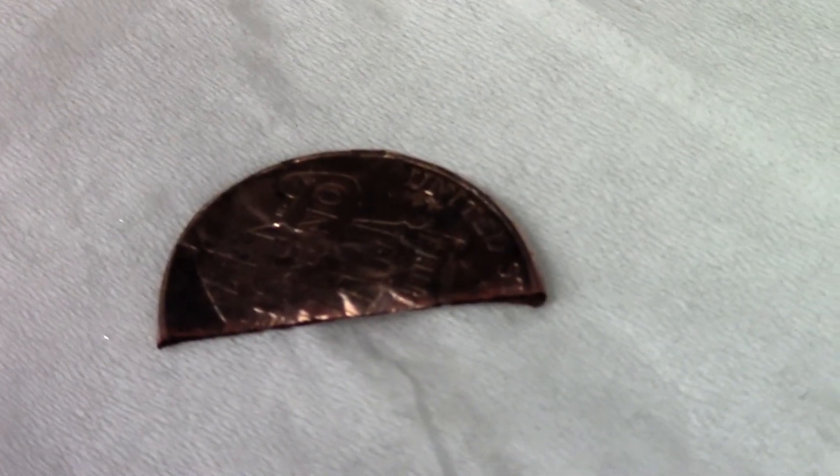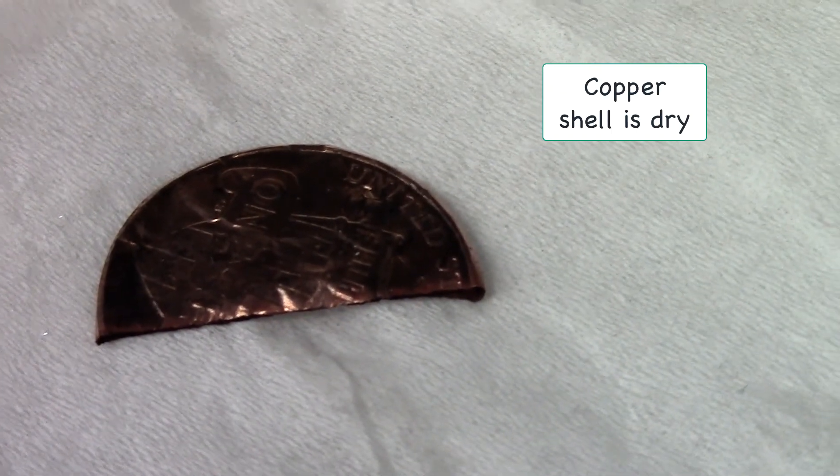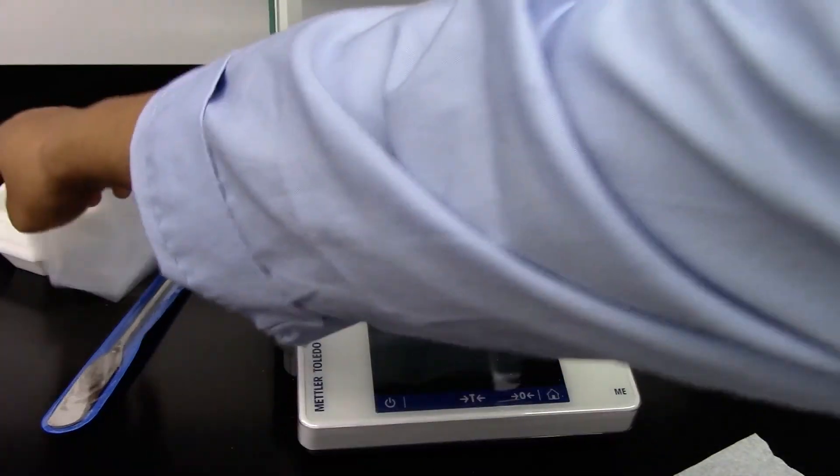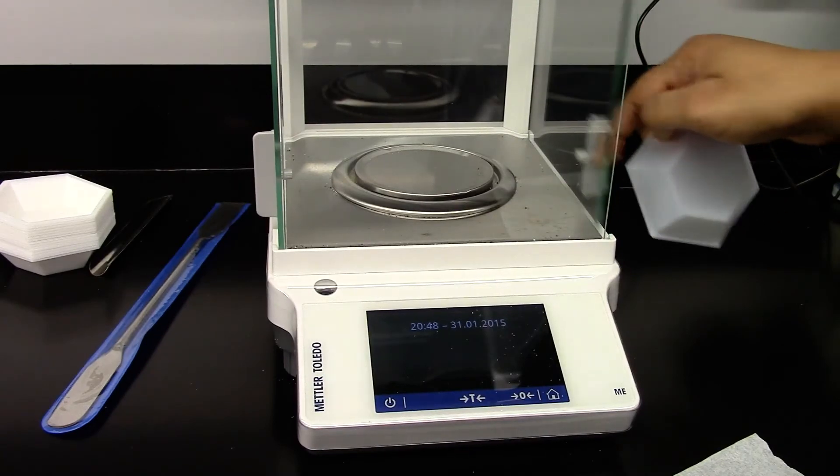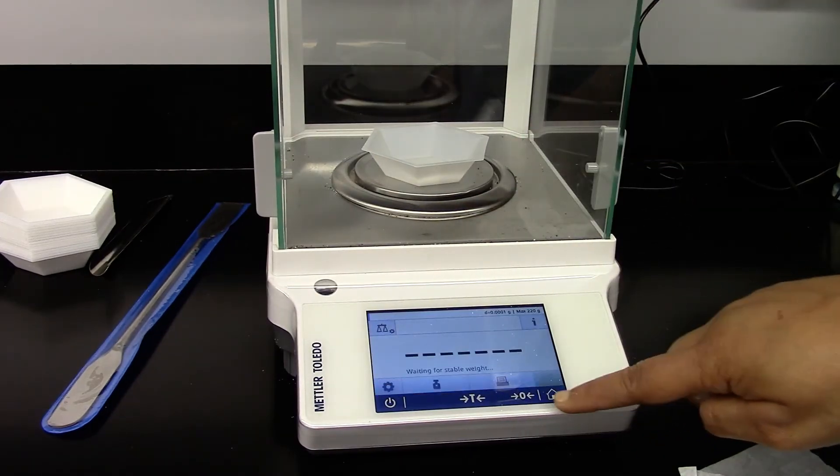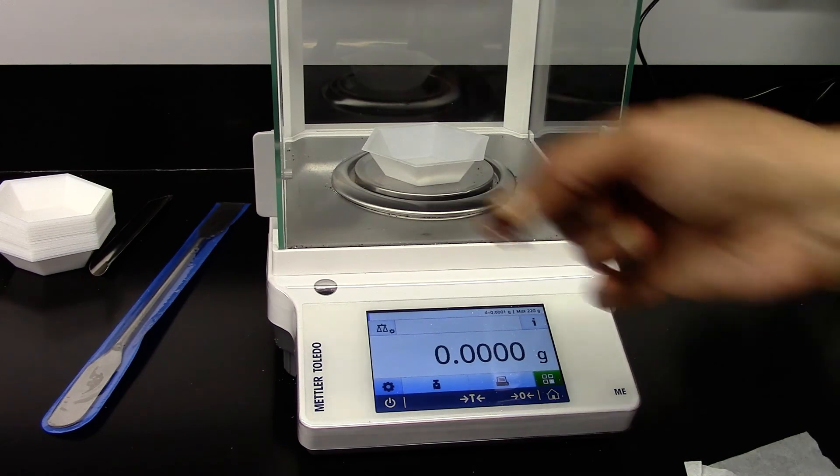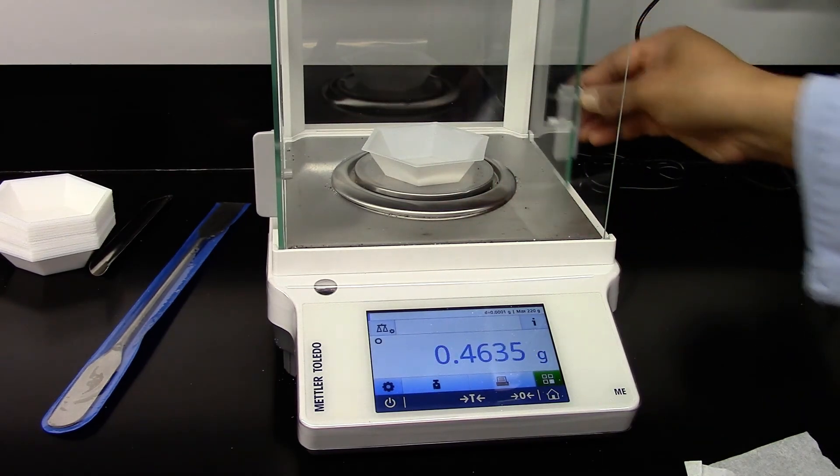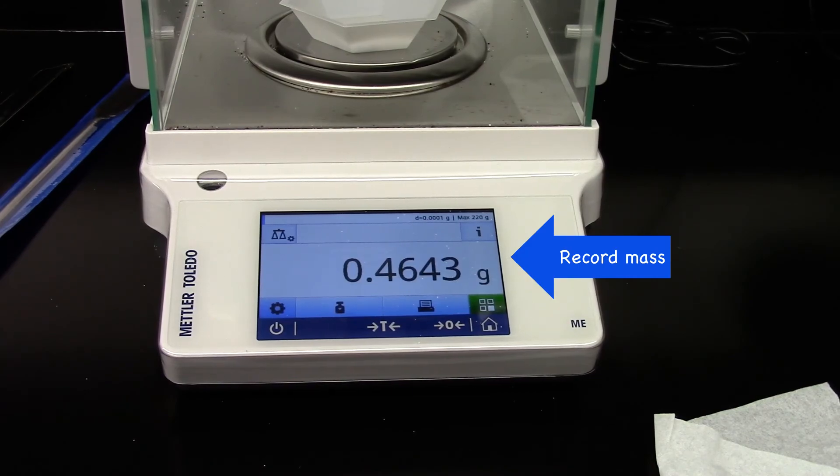I'm gently going to dab it dry. So my coin looks dry. I'm going to go ahead and weigh it out. I'm going to tare the weigh boat. Place the penny. So that's the mass.